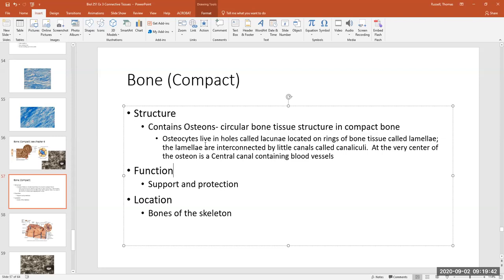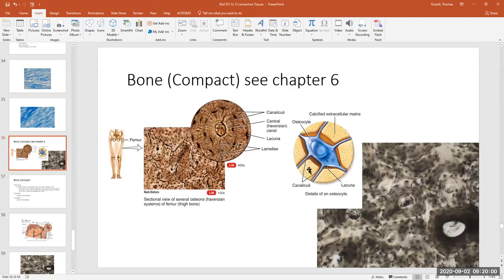These little canals run from a lacuna and basically look like little hairs — those are the canaliculi that interconnect all the lamellae and their lacunae throughout the compact bone structure.